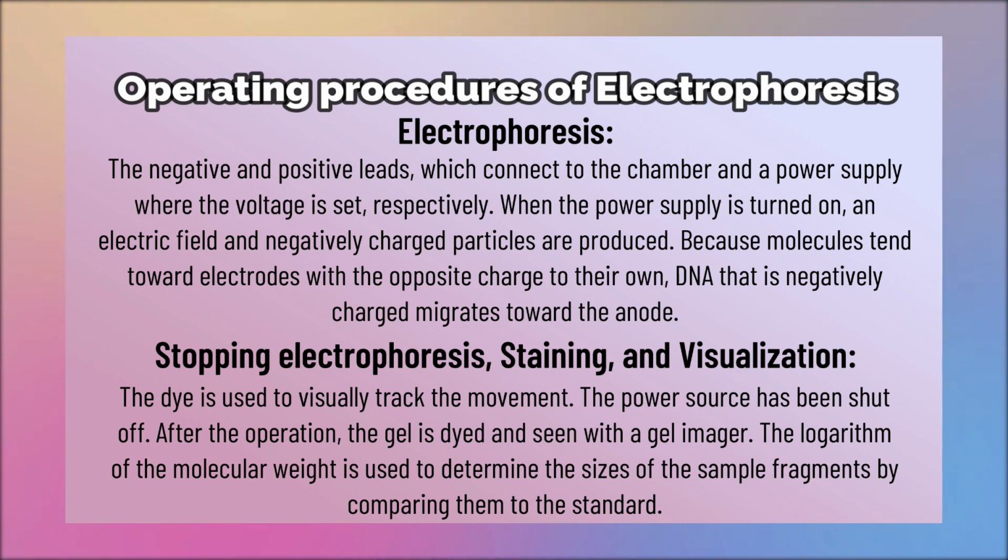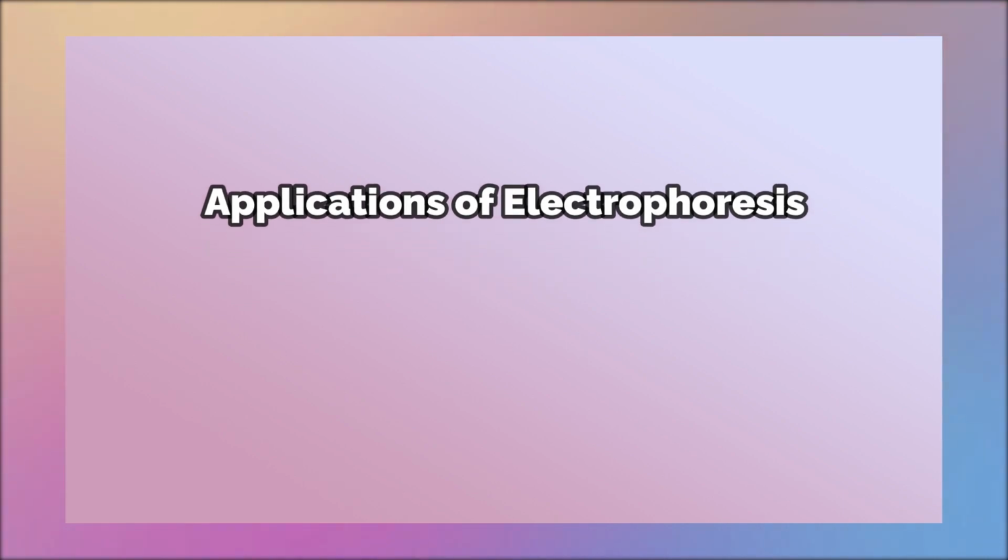Power source has been shut off. After the operation, the gel is dyed and seen with a gel imager. The logarithm of the molecular weight is used to determine the sizes of the sample fragments by comparing them to the standard. Application of electrophoresis.